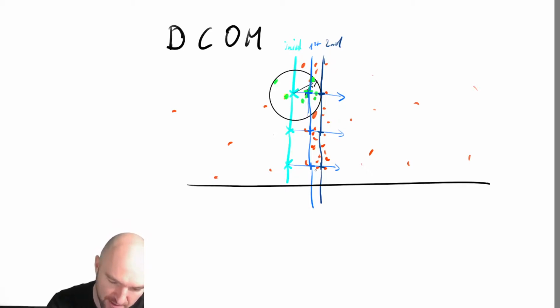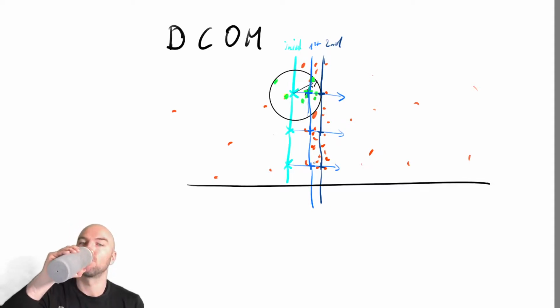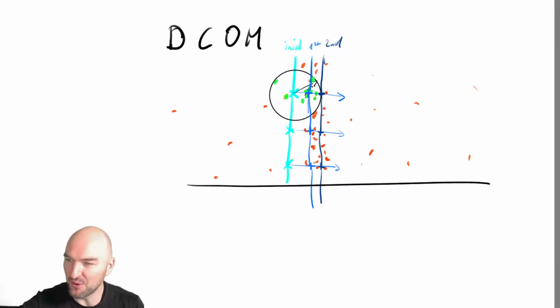On the first step, by the way, it's always going to move on the normal. So if I have a really good initial idea of where the grain boundary sits, one step is probably going to be enough anyway. So do good modeling, then you will get good quality results. And maybe one day we're going to be able to give you our super duper ray tracing algorithm, so you can outline your grain boundaries with just a click.